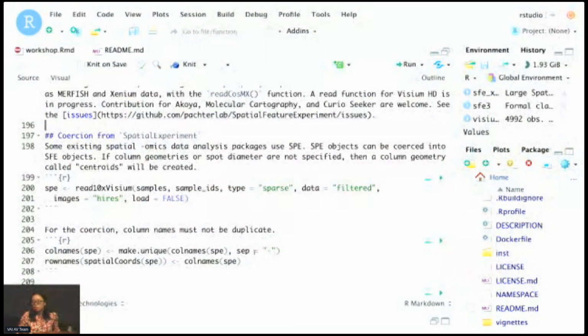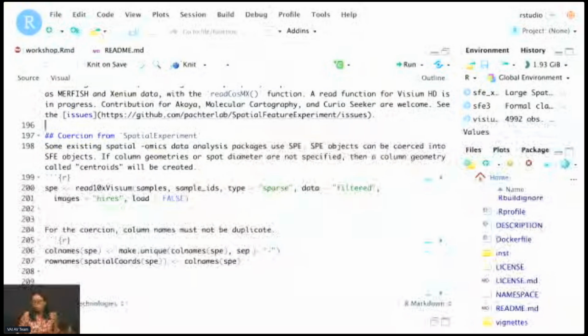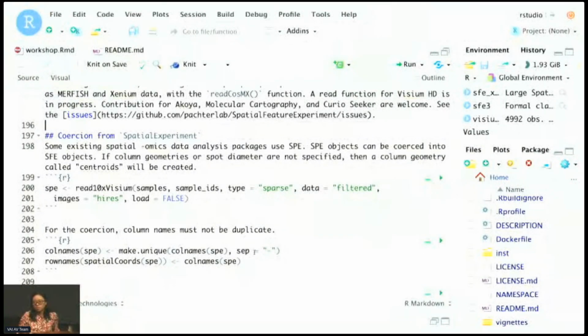If, let's say, we don't yet want to use the polygon boundaries and we just want to work with centroids, I'm trying to figure out when one would want to switch from SpatialExperiment to this? So basically, I'll get to more of that later in the workshop.